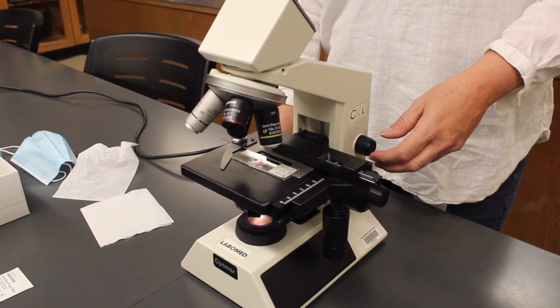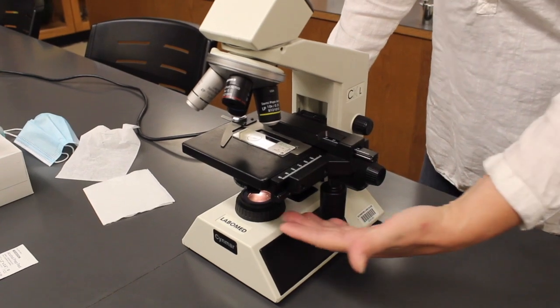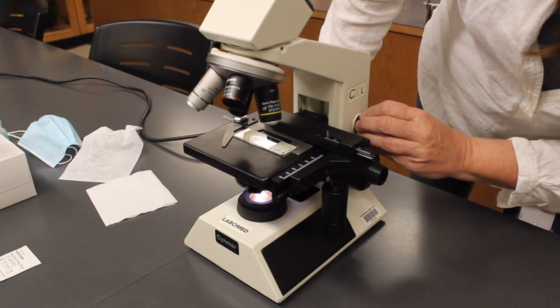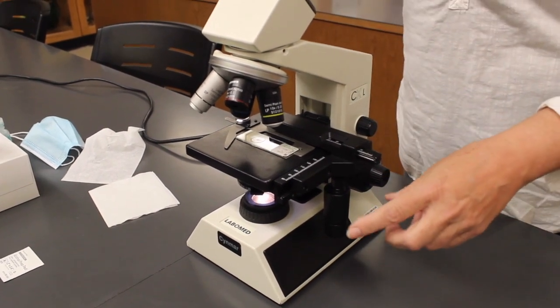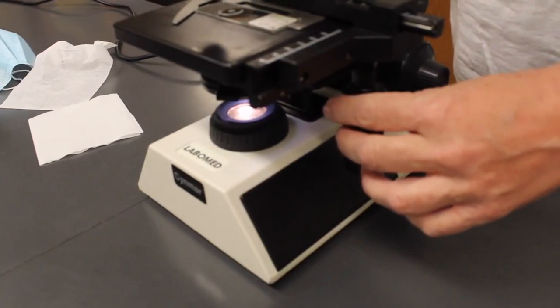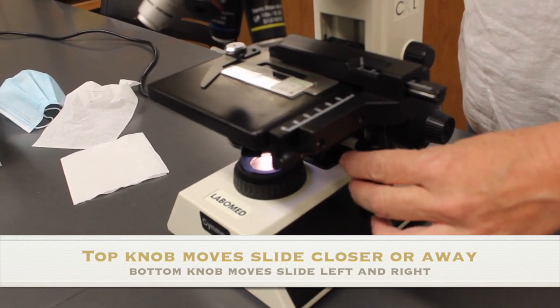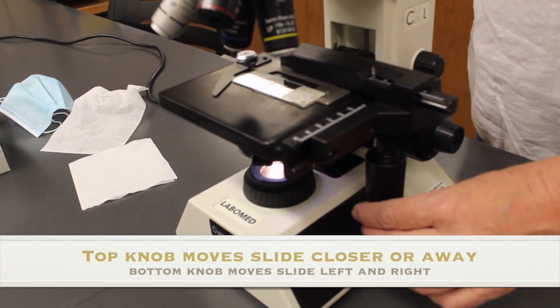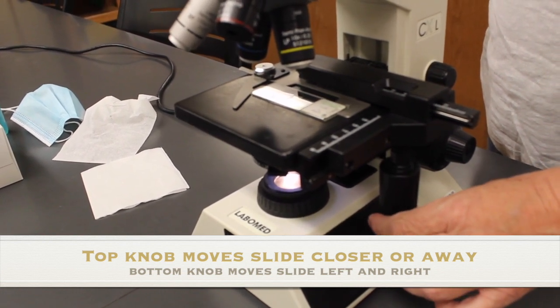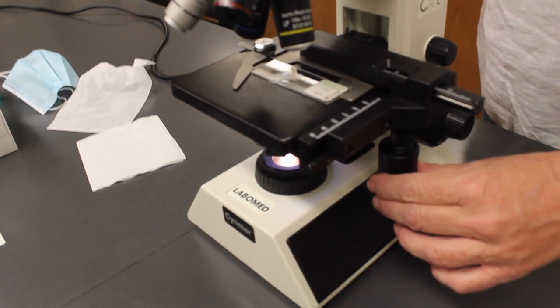The next thing that we're going to do is center the slide. In order to center the slide, we want the light to be very bright coming up from the bottom. So I'm going to turn this light up as bright as it'll go. And then I'm going to use these two knobs right here. When I turn the top knob, the slide moves backwards and forwards in space. When I turn the bottom knob, the slide moves left and right in space. So I'm going to center this letter E in that bright light. Right about there looks pretty good.